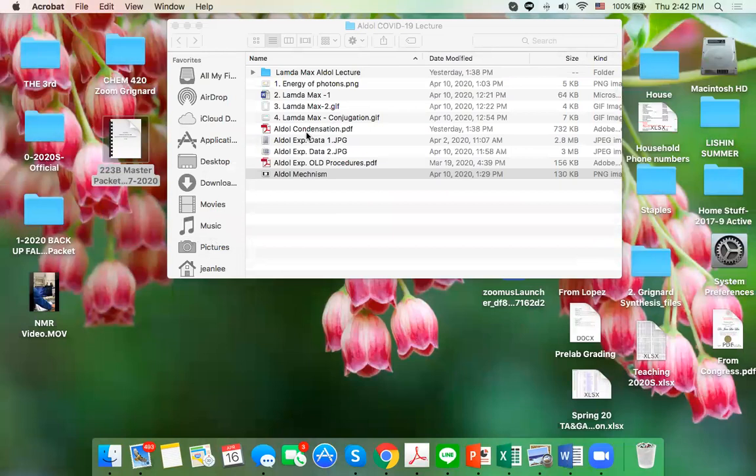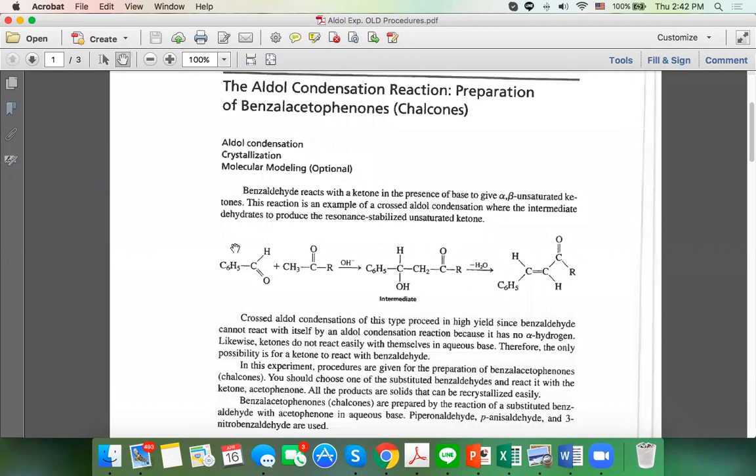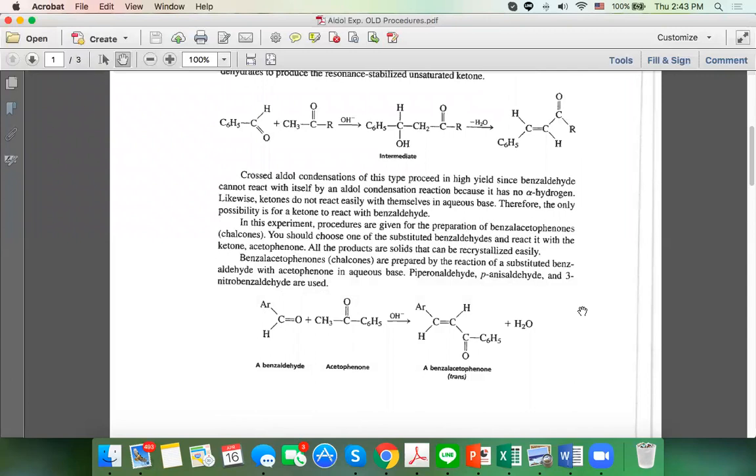Here, I want to show you the reaction one more time. Ladies and gentlemen, the benzaldehyde: you will use benzaldehyde today. You're not adding any more substituents on this phenyl group. But you're using acetone and you're using the base. Now this alpha hydrogen can expand through the carbon-carbon double bond and get the other molecule attached, forming a new aldol product. How about the other side? Go ahead and write it. All right, in this experiment, let me talk about the procedure now.